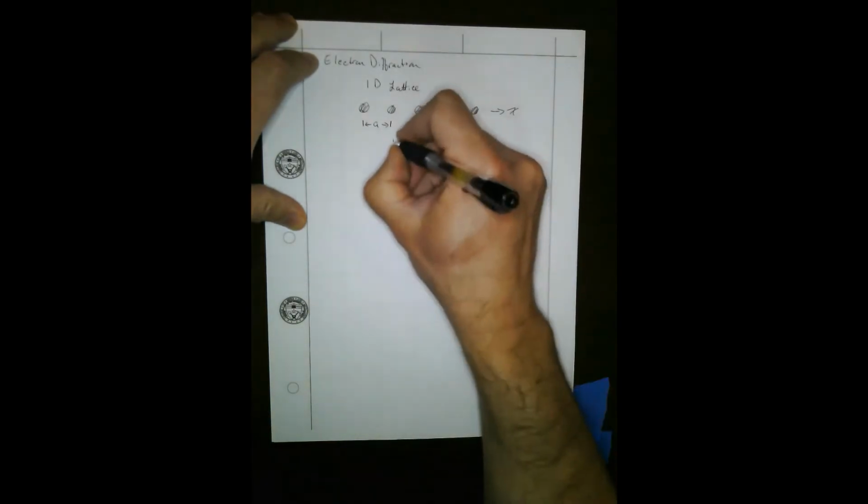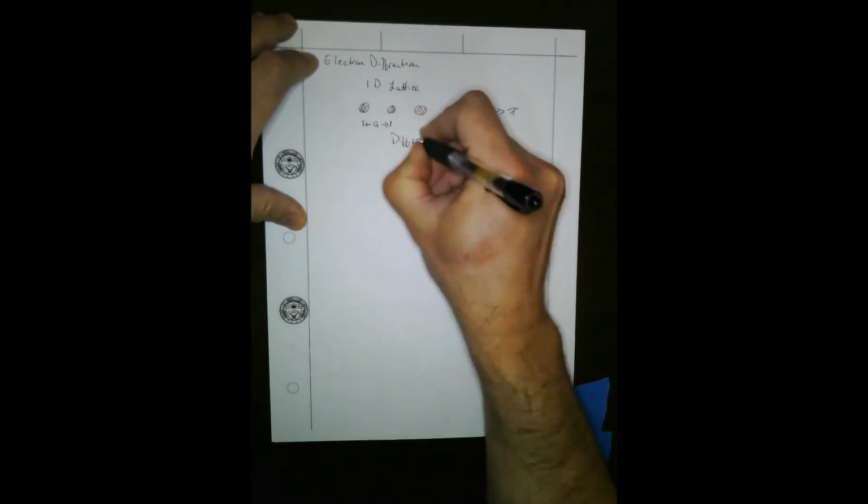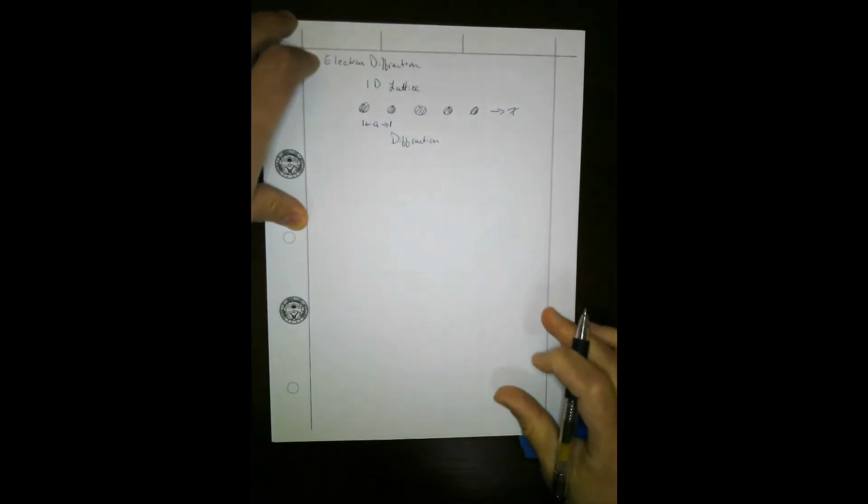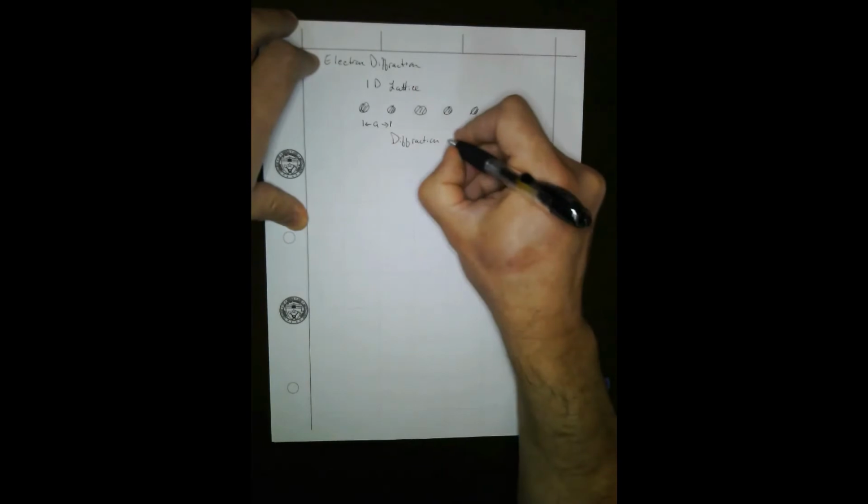Diffraction. If you think about electron diffraction, it's basically a reflection process.